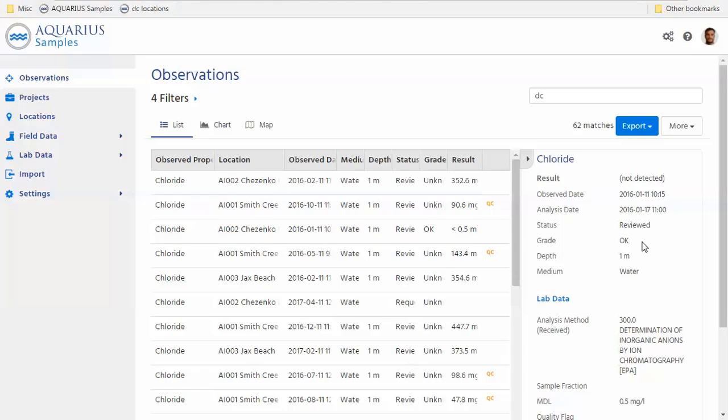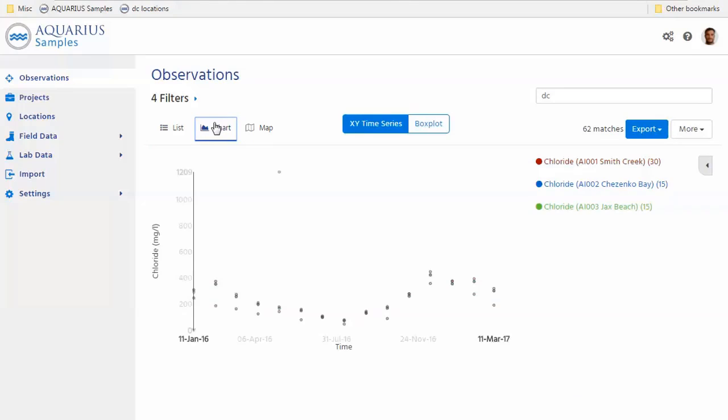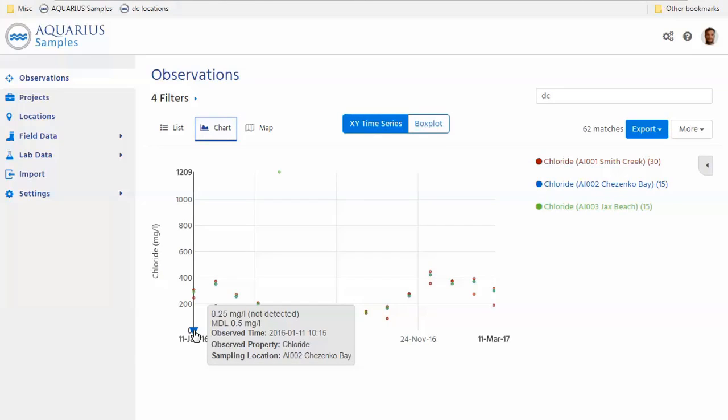And furthermore, if we look at the chart that we already looked at before, we can see down here, it's a very small value, but the tooltip will help. So it's got a built-in configuration that allows you to use a certain percentage of your detection limit within the charts. So without any manual interaction, you can just plot your non-detects, or you could export that or whatever, and use a specific share of the detection limit to show. And that really simplifies life with regards to non-detects.